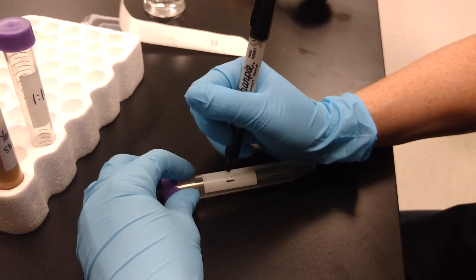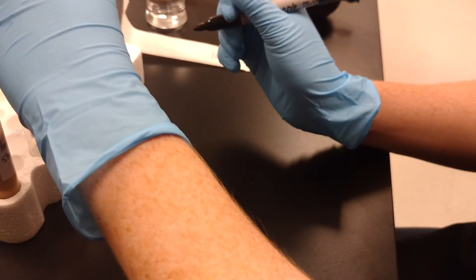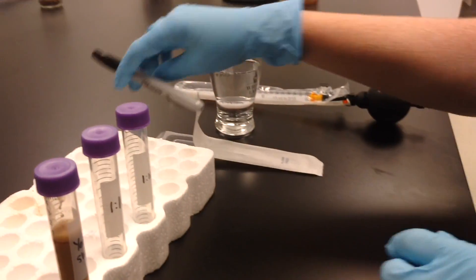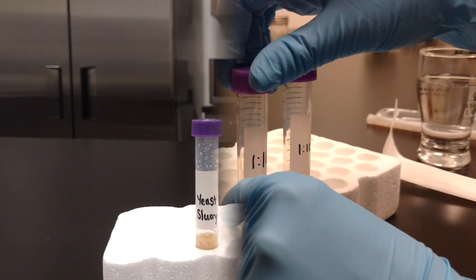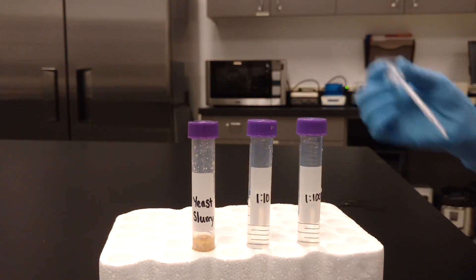Label your tubes appropriately using a permanent marker. Set up the test tubes in racks for dilutions with successive water tubes, depending on your desired dilution rate. Loosen the caps of the dilution tubes and the yeast container for the first sample.